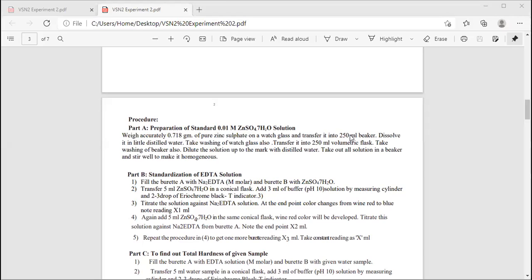So you will get hardness less than what is actual there. So every time it is necessary to find out the hardness before you are performing the experiment. And for determining the hardness, zinc sulfate is used as a standard. Now, why is it to be used? Because zinc sulfate every time we are going to prepare fresh. Because of this situation, you were earlier supposed to perform it in the lab, but now you are not performing.